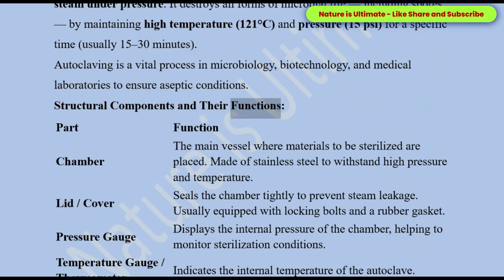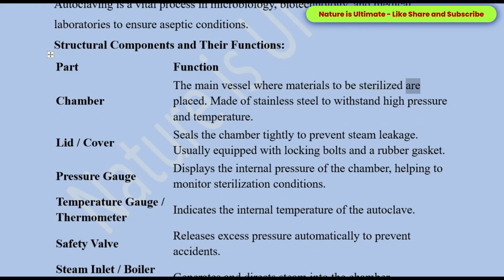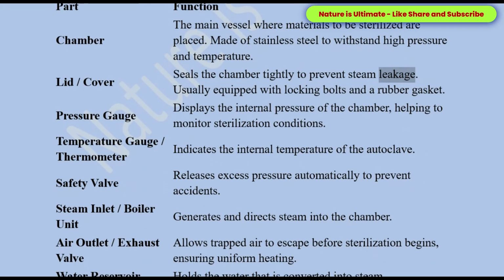Structural components and their functions. Part, function. Chamber: the main vessel where materials to be sterilized are placed. Made of stainless steel to withstand high pressure and temperature. Lid/cover: seals the chamber tightly to prevent steam leakage. Usually equipped with locking bolts and a rubber gasket.